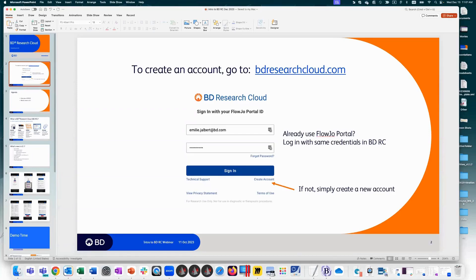Thanks for joining. If you don't already have a free account, I would recommend you set one up. Just go to bdresearchcloud.com. If you have a Flojo portal account, it's the same email and password. If you don't have one, not a problem — just hit create account and follow the instructions there.